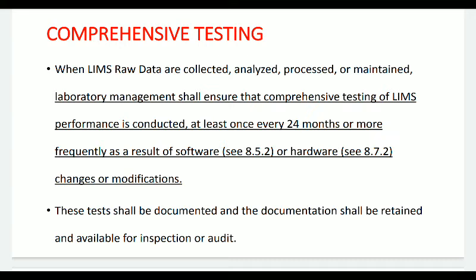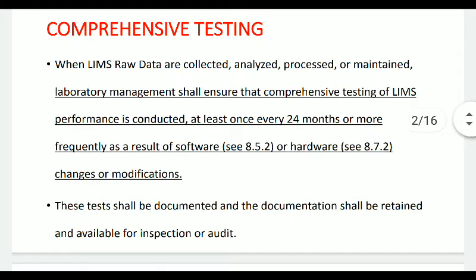Here in this guideline, we are talking about the performance audit of LIMS system, which includes both software as well as hardware.